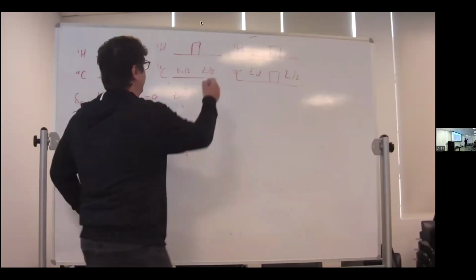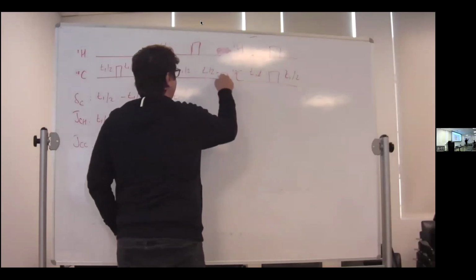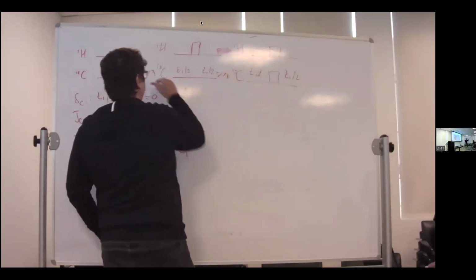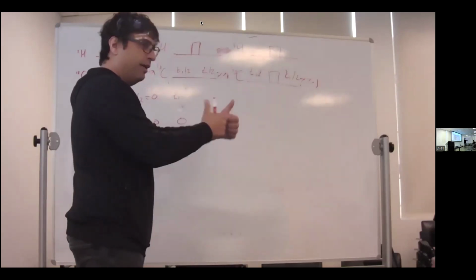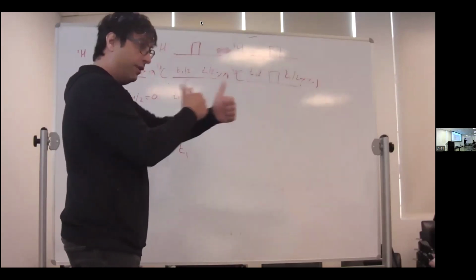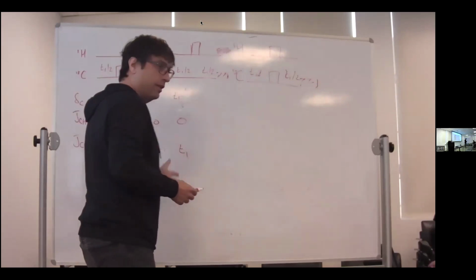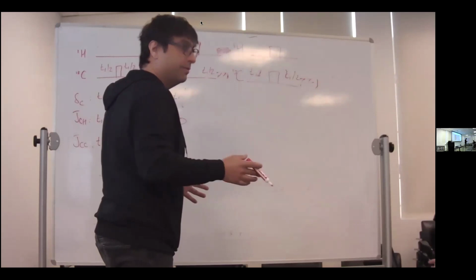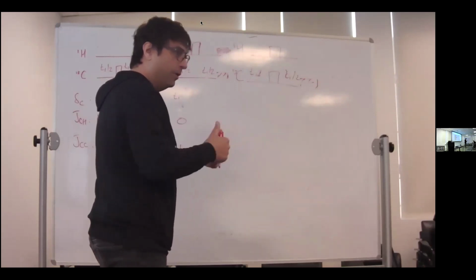But I'm always applying decoupling. Yes. So then I'm going to get in-phase doublets on the carbon, separated by the carbon-carbon splitting, which could be a useful experiment if you want to measure carbon-carbon RDCs, for example. And then you can do an IPAP experiment to separate the two components.